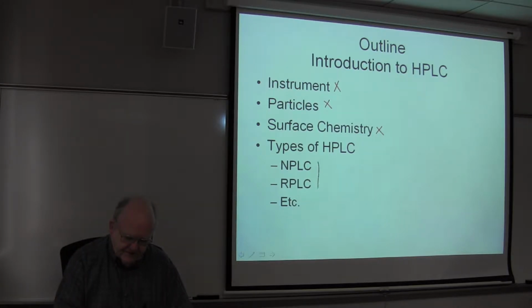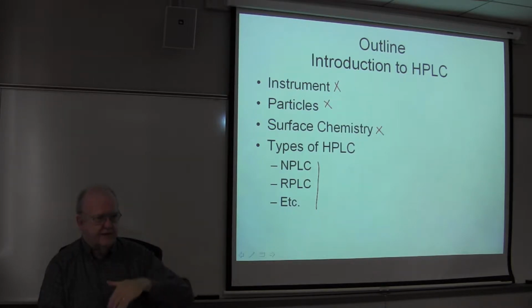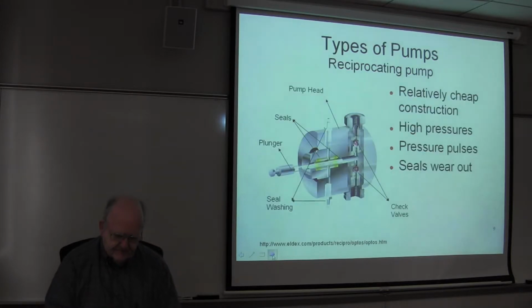And then we'll talk about the different kinds of HPLC: normal phase, reverse phase, ion exchange, and sort of a big picture of what they are and what they're used for. And then later on we'll get into the details of how they work.